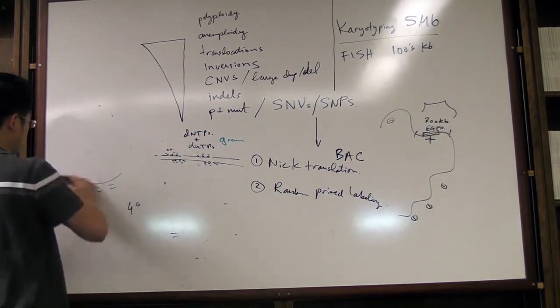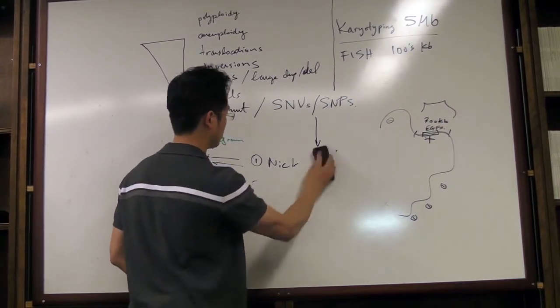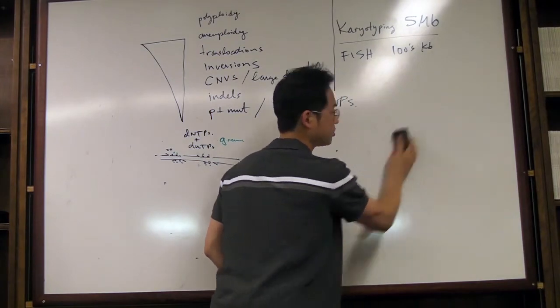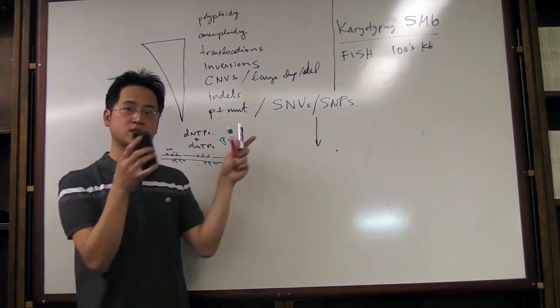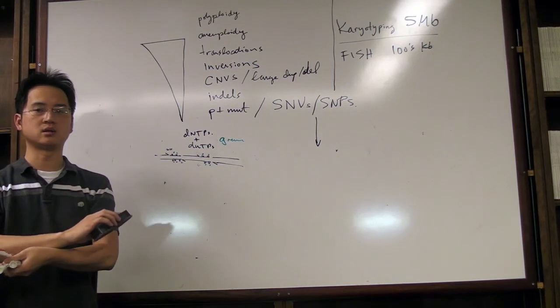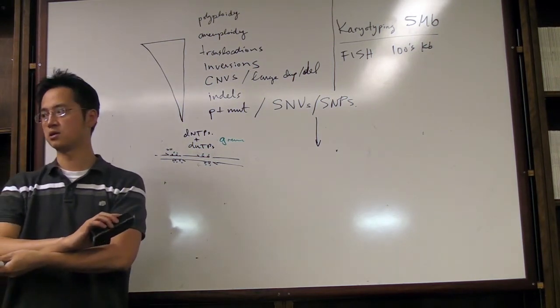When it's hybridizing, it's all based on not random, but Watson-Crick base pairing, A to T, C to G. That's another level of specificity. So the backbone determines the specific target that you're doing, but the Watson-Crick base pairing based on hybridization is the additional step of specificity that's added to your system during the probing.